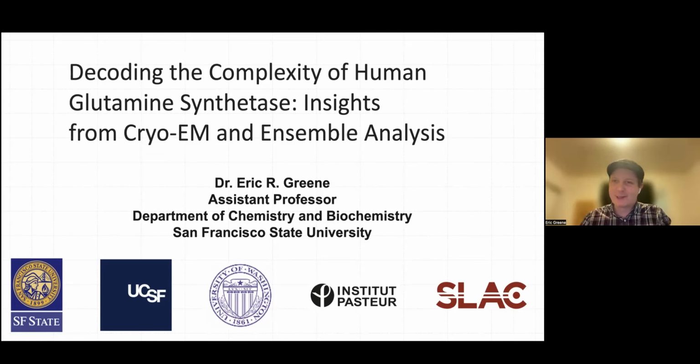I'm really excited to be here to share this work with you all. Part of it is my postdoc work, and part of it is now carrying on into my own independent lab now at San Francisco State. I entitled this "Decoding the Complexity of Human Glutamine Synthetase" because though this has been a model enzyme system for many decades, I think with new technologies in cryo-EM, and specifically looking at things from an ensemble perspective, we're able to really gain new insights into this fascinating enzyme.